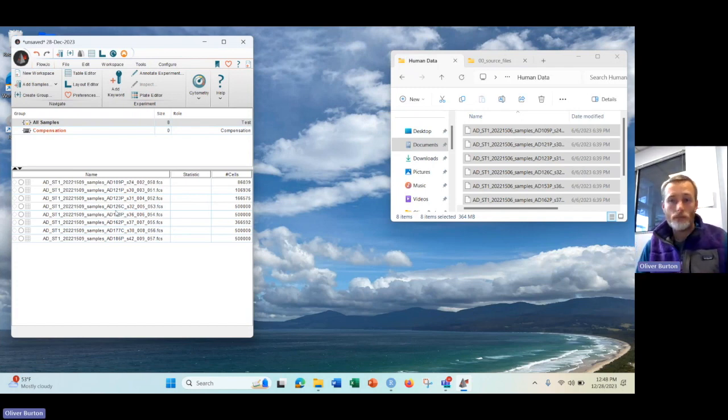We could, in this case, actually select the files based off of P underscore and C underscore and separate them based off that. They do have identifiers written in them, but we're going to use this as an example of how to do it in case you actually didn't have that, or you wanted to put in identifiers that are easier to read.